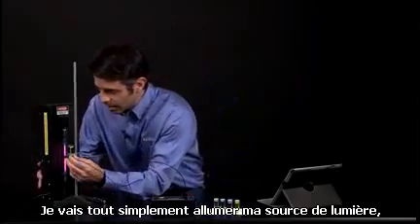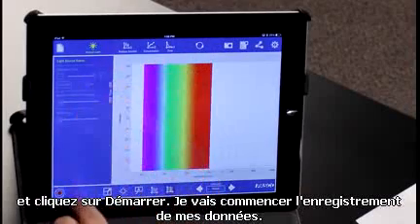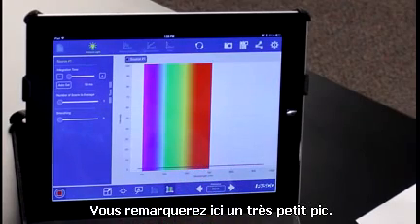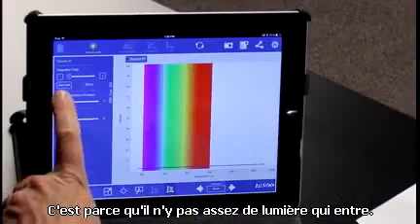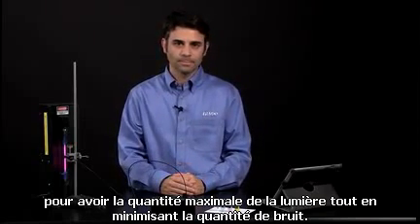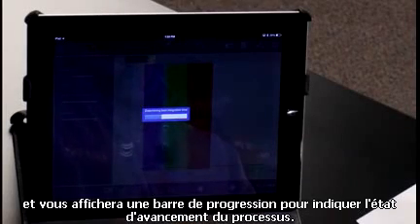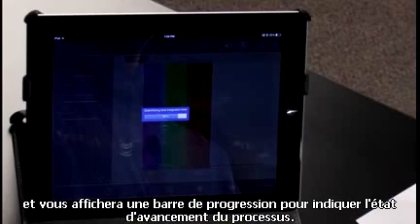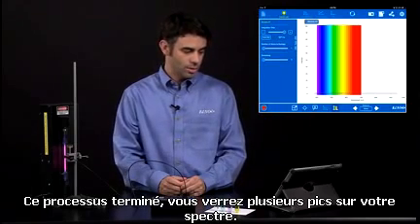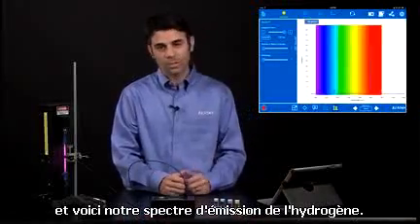I'm going to turn on my light source, make sure everything is lined up nicely, and hit start. You'll notice a very tiny peak right now because not enough light is getting in. I can auto-set the integration time to allow the maximum amount of light in while minimizing noise — the software does that for you and determines the best integration time. It'll give you a progress bar to indicate how far along that process is. After the process is complete, you'll see more peaks on your spectrum. You can auto-scale that, and there's our hydrogen emission spectrum.